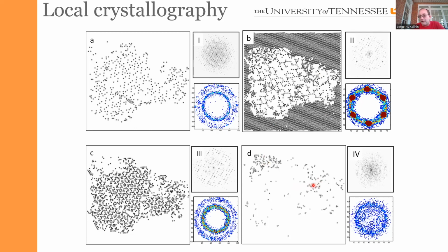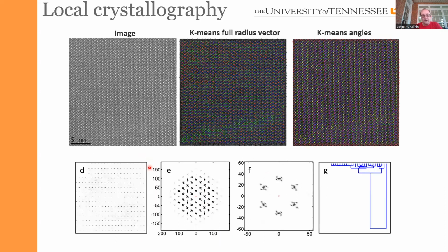I mean, of course, it has to be quantified, but simply based on the visual examination, it looks like these atoms are amorphous. And this group seems to be complementary to this one. So if I were analyzing this, I would probably pull these two into one group. As I said, you always choose the number of groups based on your external guidance. You rarely have the identification based on the data only.